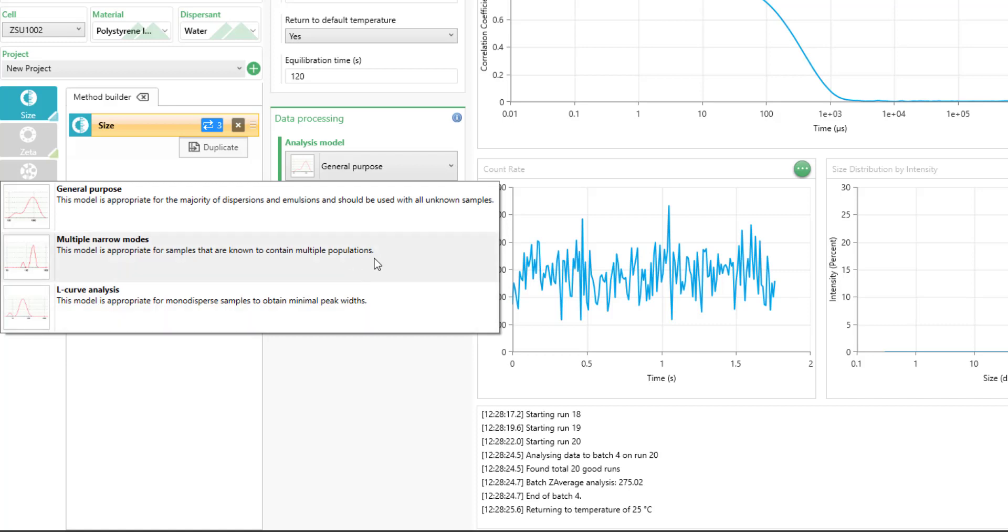If you see that your sample has multiple populations, changing it to the multiple narrow modes will just give you a little bit higher resolution data by changing this algorithm.